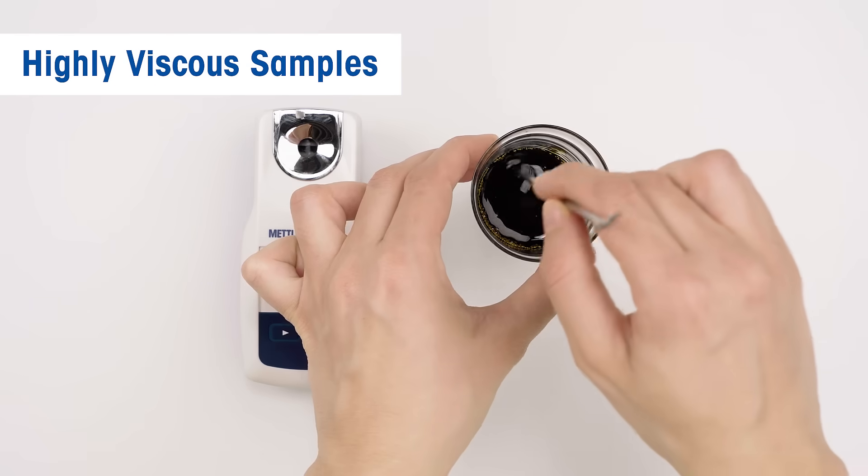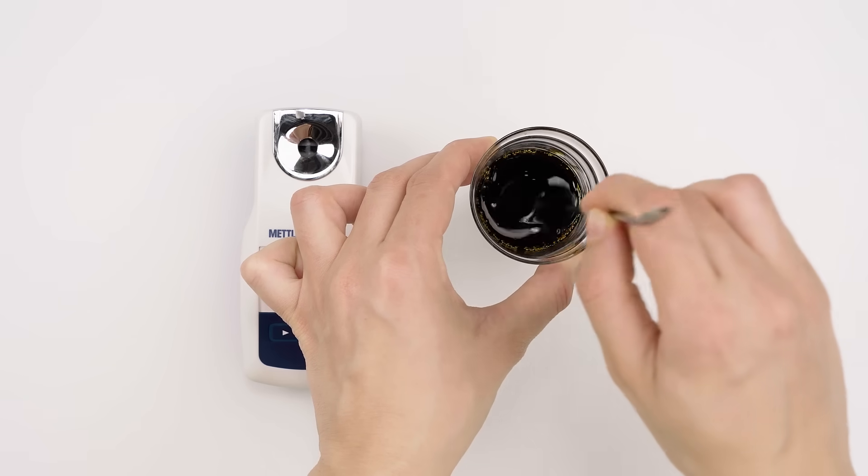Finally, for highly viscous samples, apply gentle stirring to avoid bubble formation.